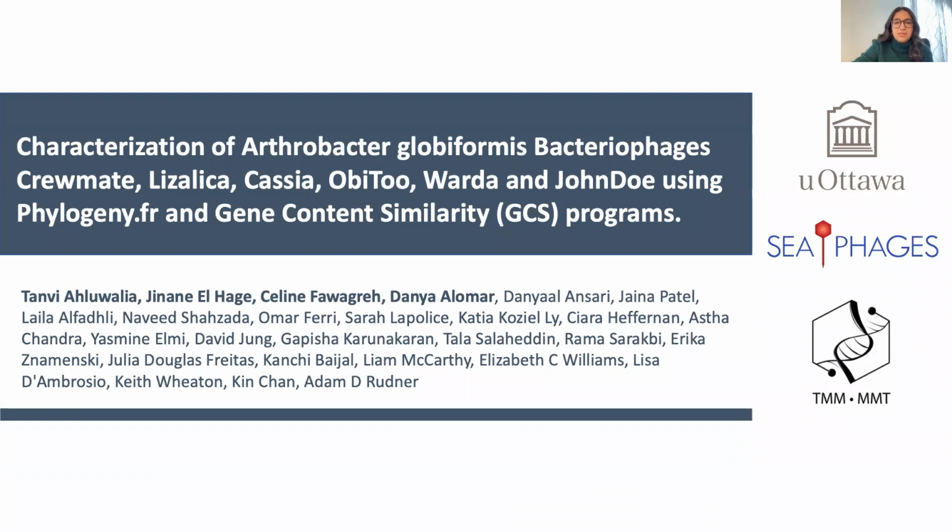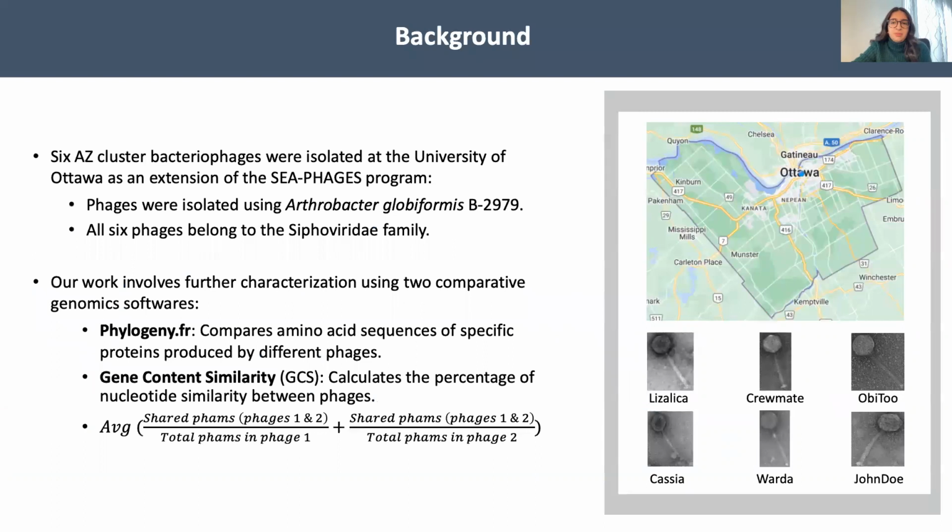Hello everyone, today I'll be talking about our project on the characterization of Arthrobacter globiformis bacteriophages Crewmate, Lizalica, Cassia, ObiToo, Warda, and JohnDoe using phylogeny.fr and gene content similarity programs. So let's start with some background as to where this project came from and what we're doing.